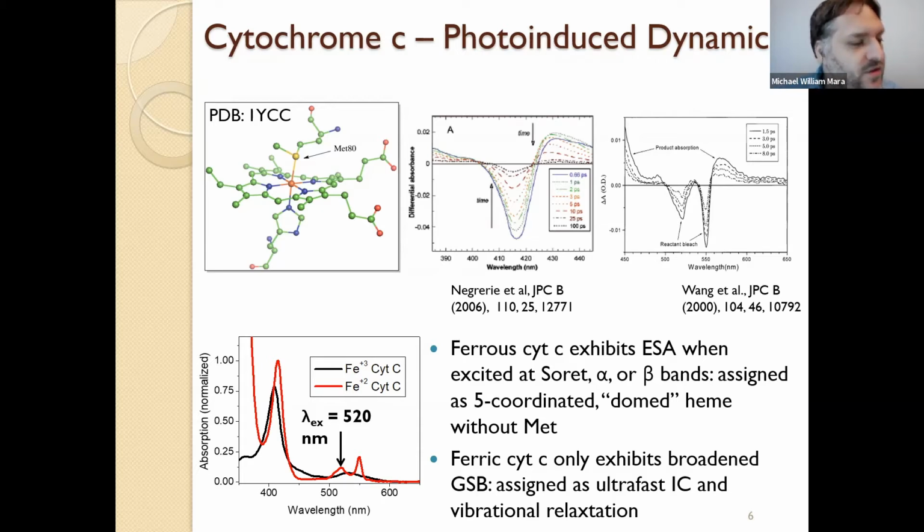And for reasons that we'll discuss later, in particular understanding the thermal dissipation from the active site, it's really important that we know that everything we're observing corresponds to one photon per absorption event. Generally, we ensure that with the power titration. All right, very good.